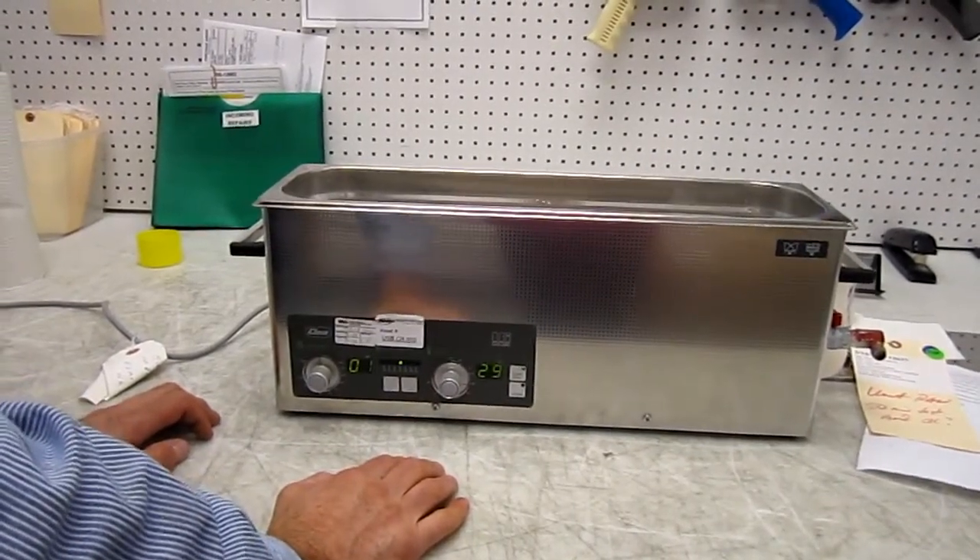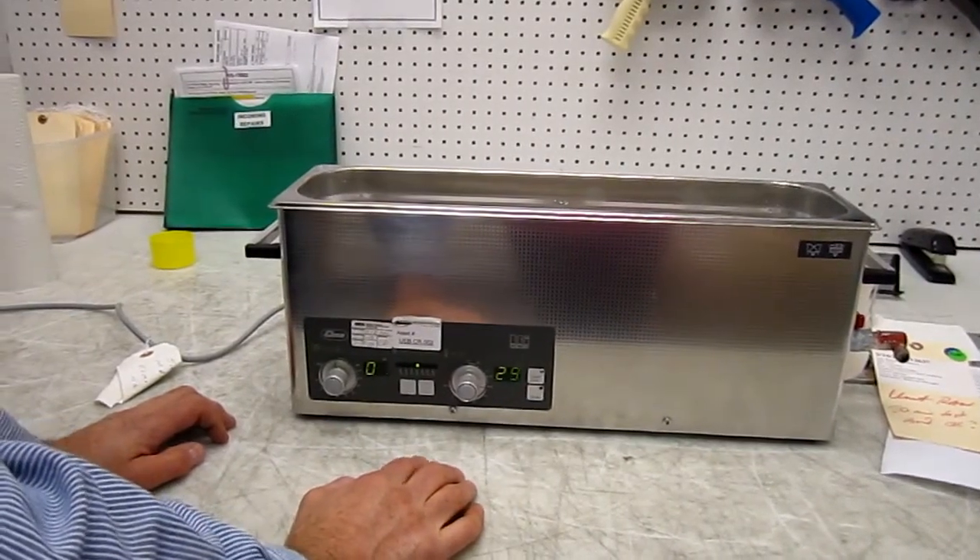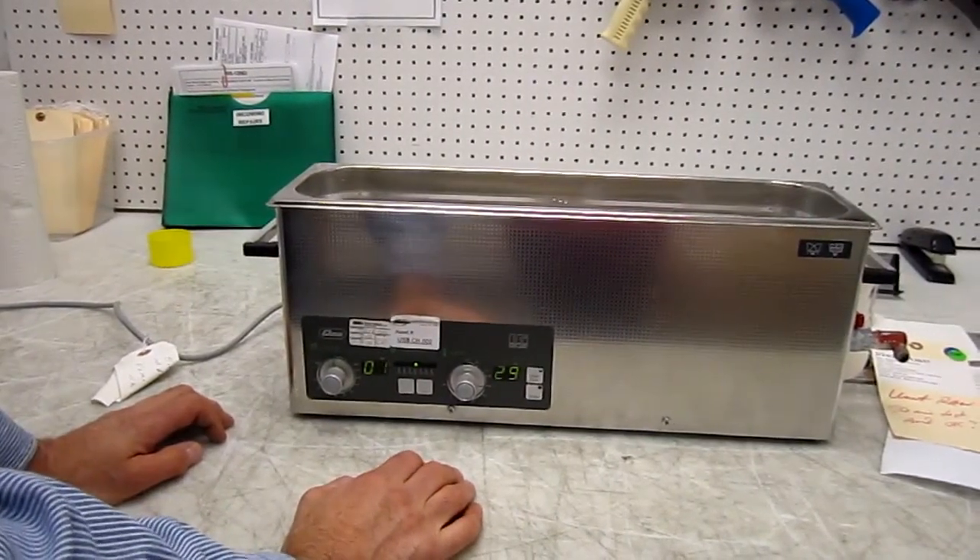The unit is running properly. We tested it for several hours and I find no more problems with it. If you have any more problems, please contact us. Thank you.